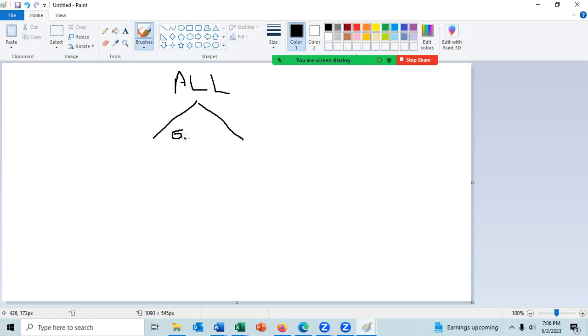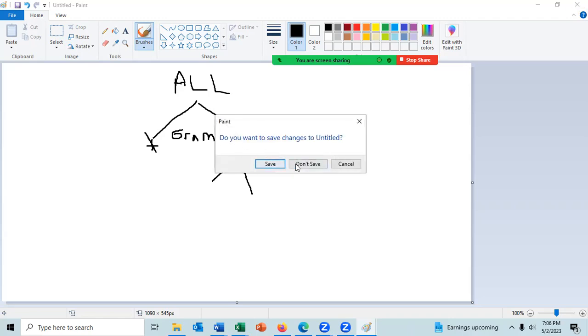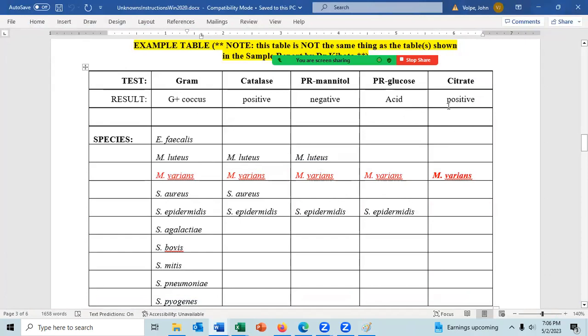Not too bad. And there's the gram positive, the gram negative. And we'll scratch this. And then you do something to separate the gram negatives. So you can have your drawing something like that. Okay, so it can be a figure like this, or it can be in a table. For most people, if they want to type, use the table, because it's difficult doing it in a figure if you're typing. But you must have something like that in the report.